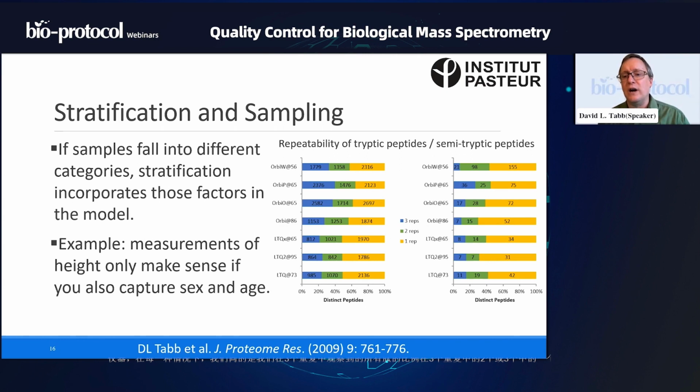And in each case, we're asking what fraction of all of the peptides identified were observed in all 3 replicates, in 2 of the 3 replicates, or in 1 of the 3 replicates. So you see that the blue bar is the number that we're seeing in all 3 of the replicates. The green is 2 of the 3, and the yellows are the 1 of the 3. At the left, we're looking at fully tryptic peptides, which is to say that this peptide conforms with what trypsin should be cutting on the N-terminus and what it should be cutting on the C-terminus.